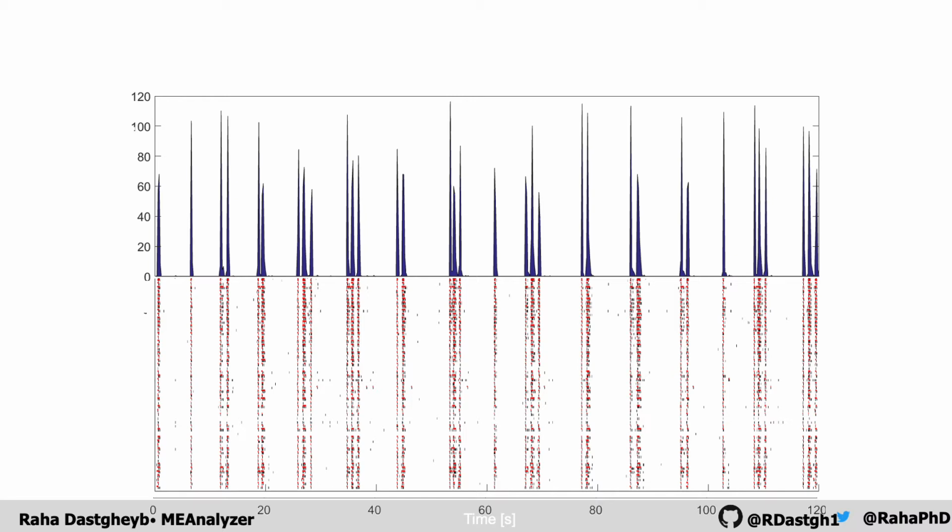In making this binned plot, I've made an assumption about the temporal resolution I think is important. If I change that and I have 1 second bins instead, this graph will look completely different. It doesn't mean that one of these is right and one is wrong, it just means that the design is completely fluid based on my assumptions. And based on our ability to make observations, I think that this activity on this plate looks periodic. So we can move on to analyzing that.